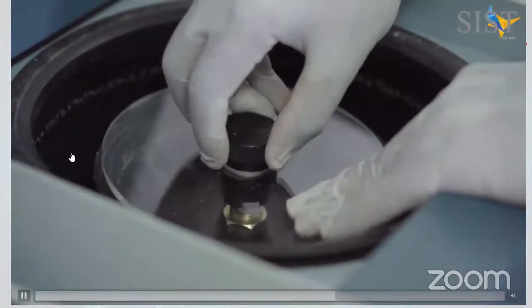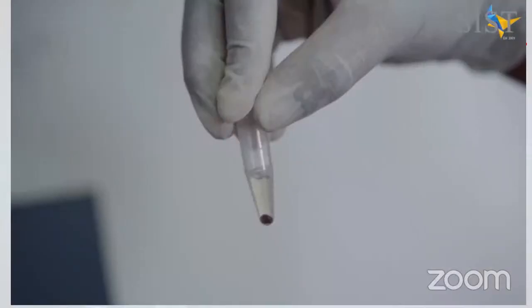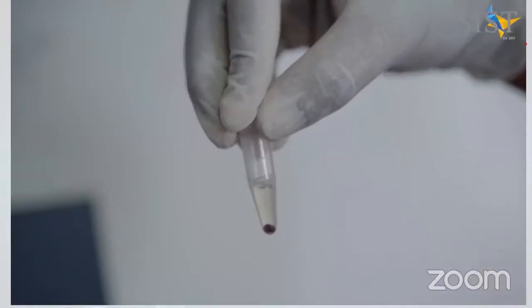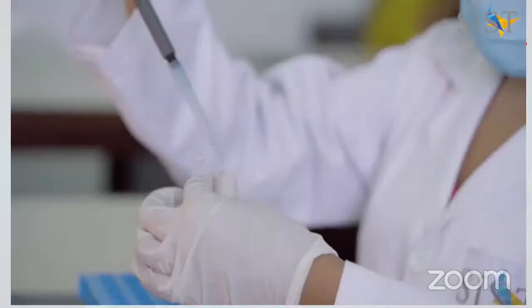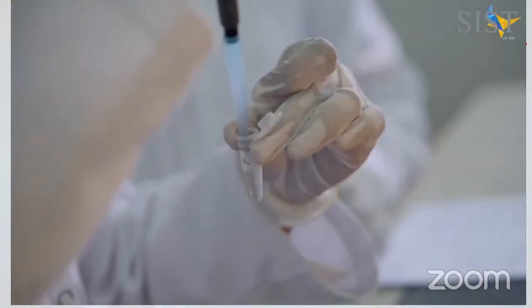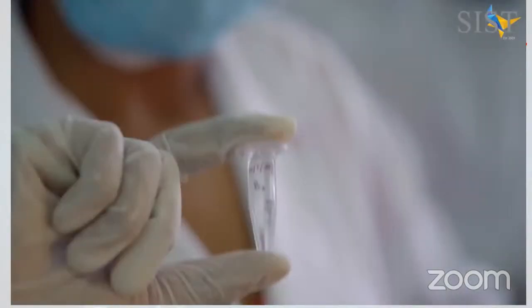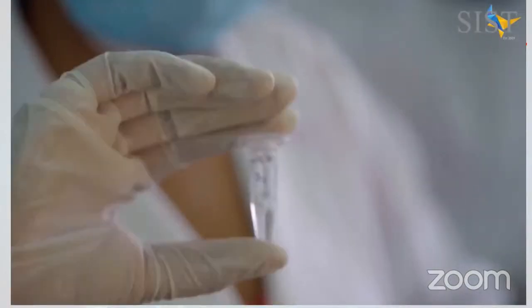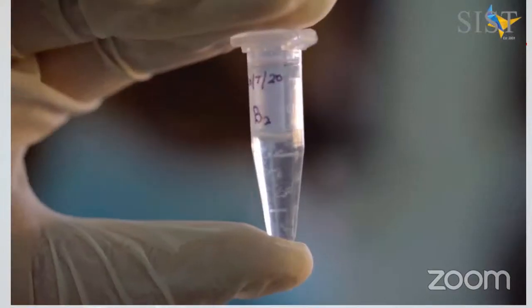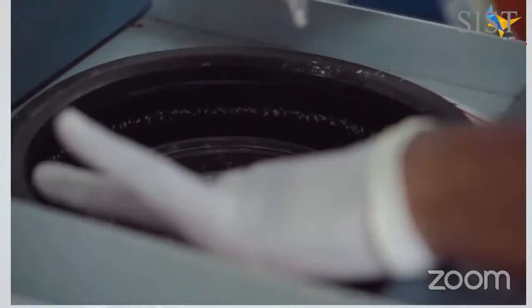A supernatant and a protein pellet will be visible after the centrifugation step. You carefully transfer the supernatant using a micropipette to the fresh tube containing isopropanol. Once you transfer the entire supernatant, you will invert mix the contents in order to observe short white strands of DNA getting precipitated in the tube. This is followed by a centrifugation step to obtain the pellet of DNA.